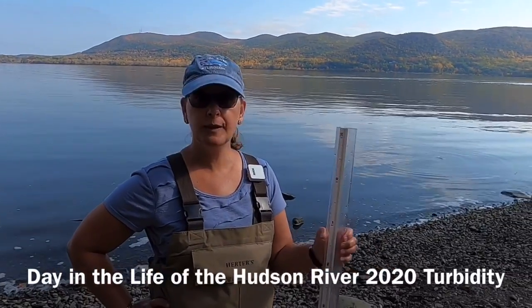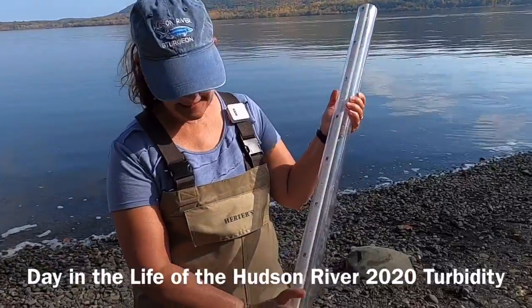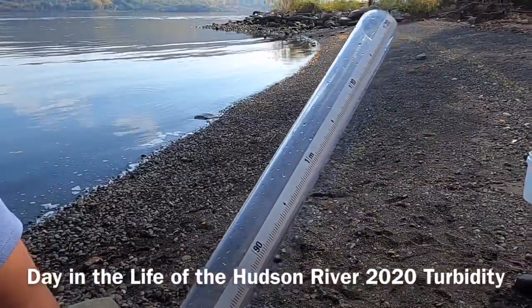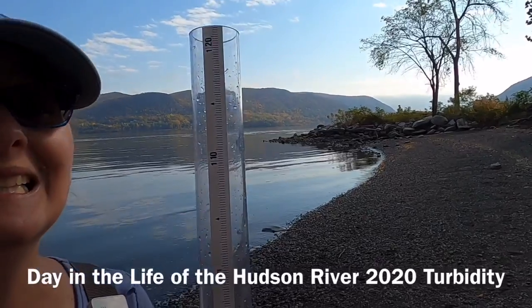So we're going to talk about this tube. It's a turbidity tube, and it has measurements in centimeters. Now, what this turbidity tube is going to allow us to do is try to figure out at what depth we can see something called a Secchi disk.